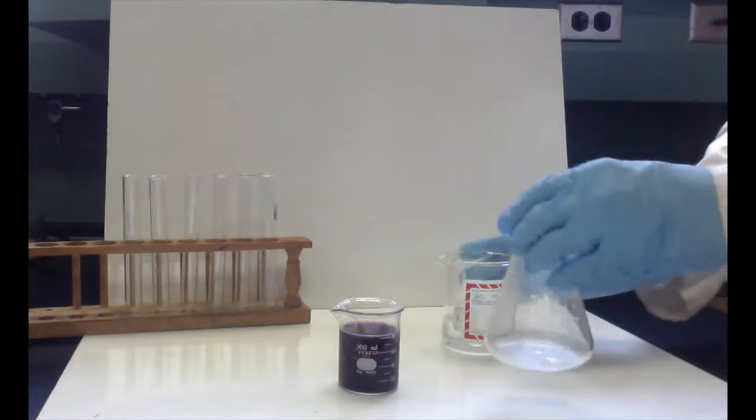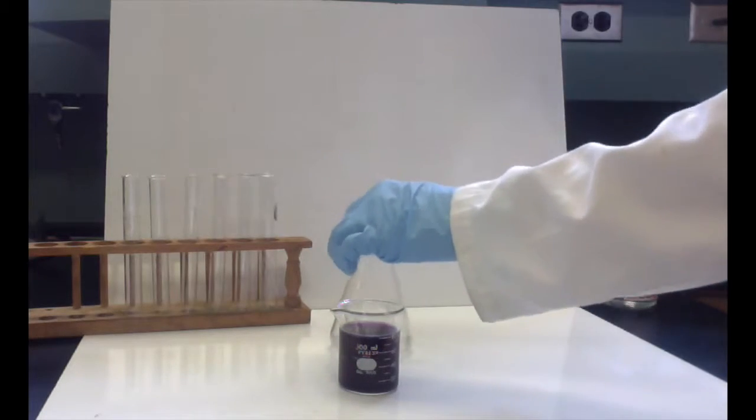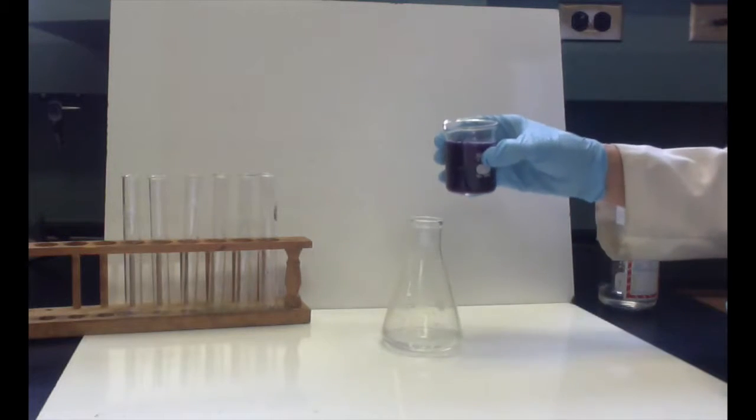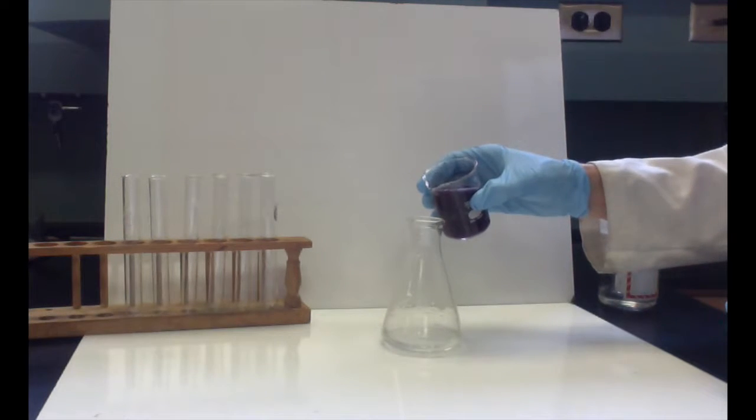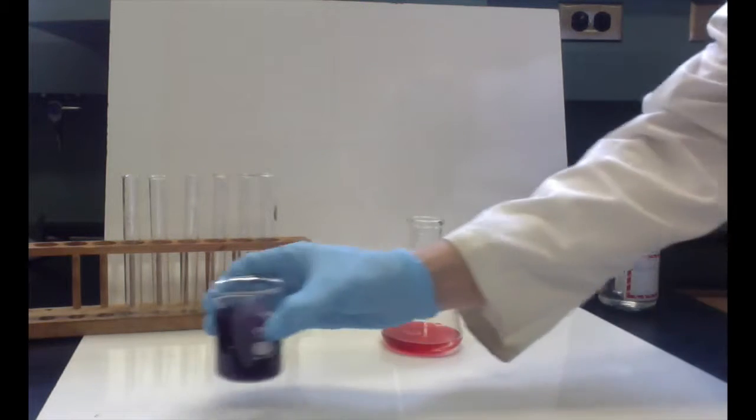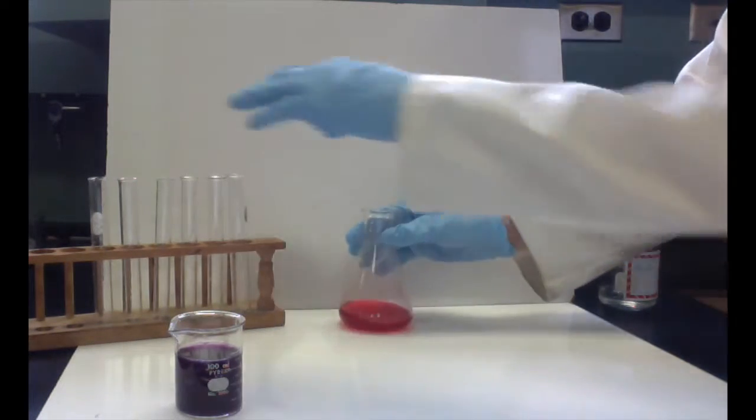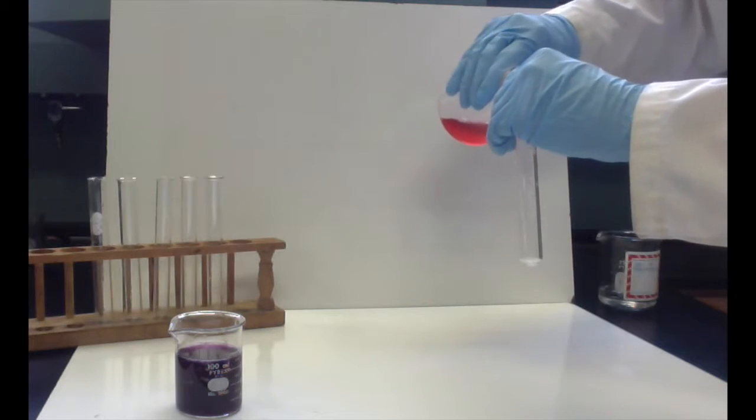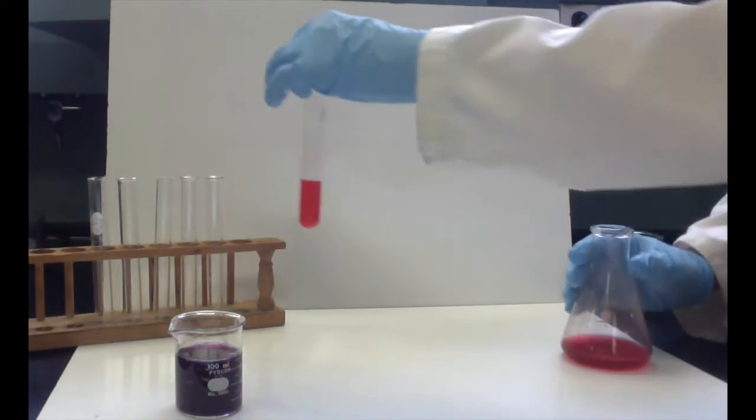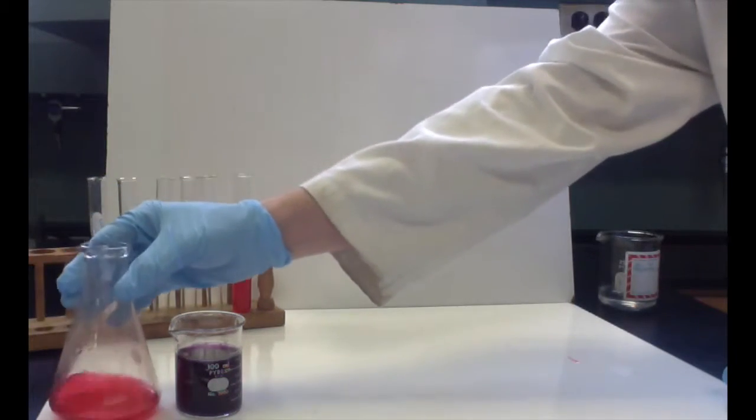When we take our hydrochloric acid, it's clear and colorless. When we add a little bit of the cabbage juice, it becomes bright red. So let's put that into this test tube here. See how red that is? This would be a very low pH. That's our hydrochloric acid.